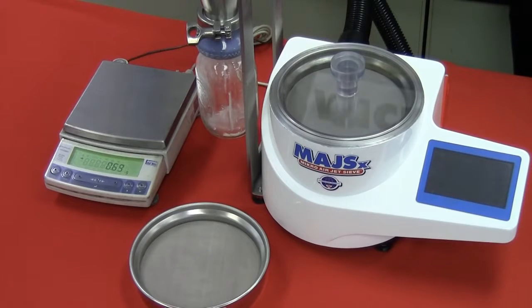Now that the unit is set up, the next step is to turn on the components. You want to make sure that the balance is powered on and that the vacuum is plugged into the back of the airjet sieve with the power switch in the on position. These two components must be turned on and plugged in before we start up the airjet sieve.